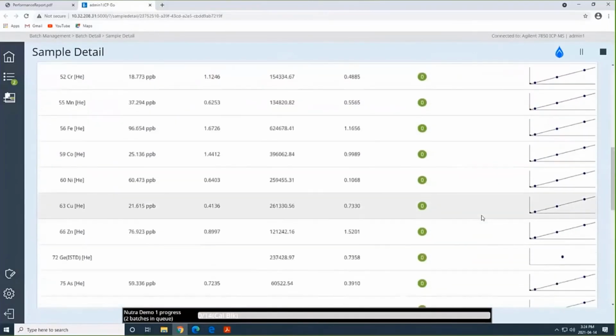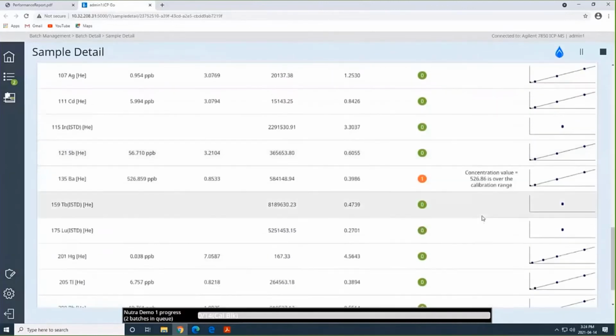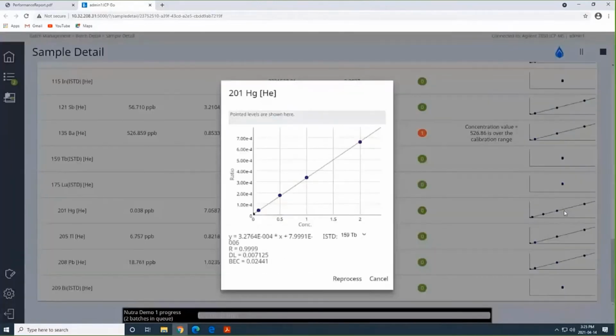And the other thing I wanted to mention is, since we're doing nutraceutical, we're really concerned with the big four, and sometimes with some of the major elements for proof of labeling or whatnot. But I did analyze for mercury, and mercury needs HCl in order to be stabilized within the calibration.